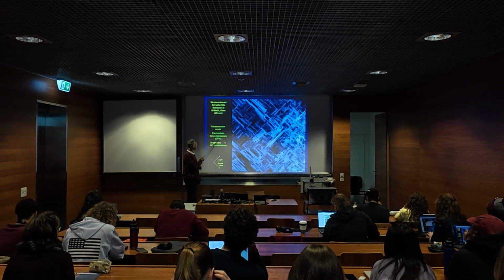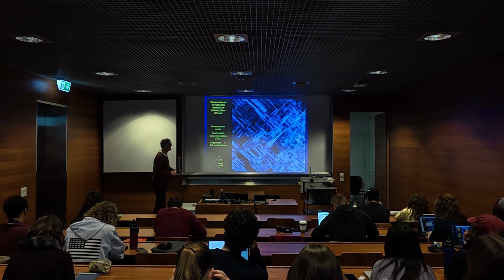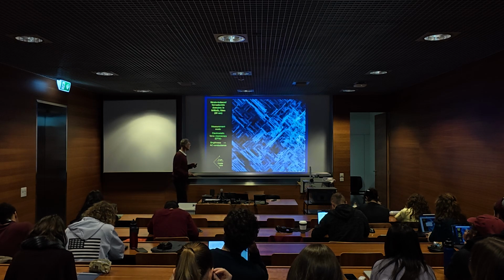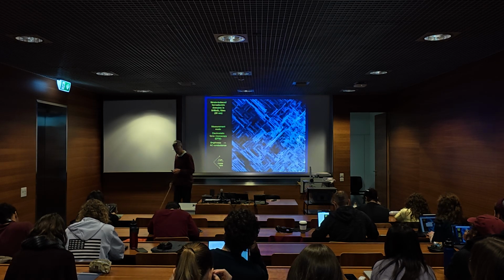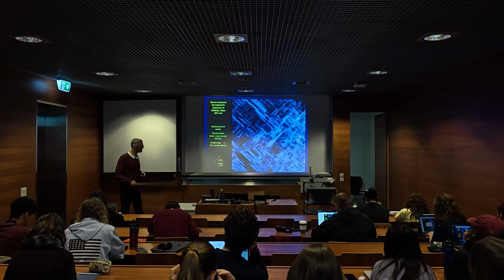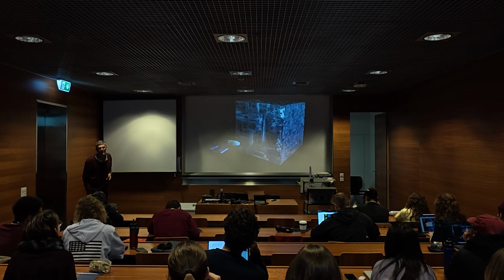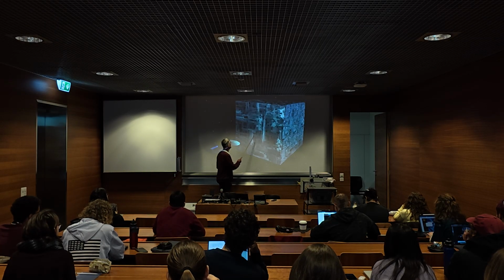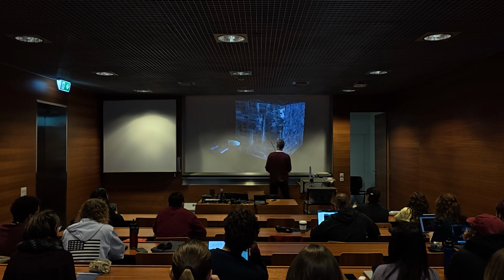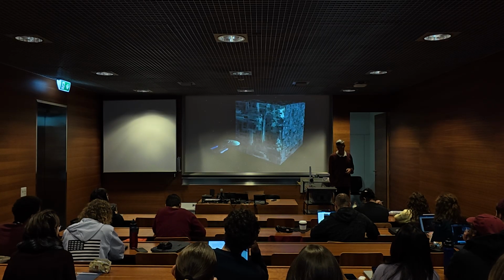mode called electrostatic force microscopy. So you probe charges on the surface, basically. And then you see this beautiful pattern, and so you can see, aside from the usefulness, they really can have an aesthetic value. When I saw this, I thought, oh wow, this reminds me of something, maybe this. So those of you who still watch Star Trek, that is actually not the Borg cube, this is our domain pattern that I've just shown. Good.